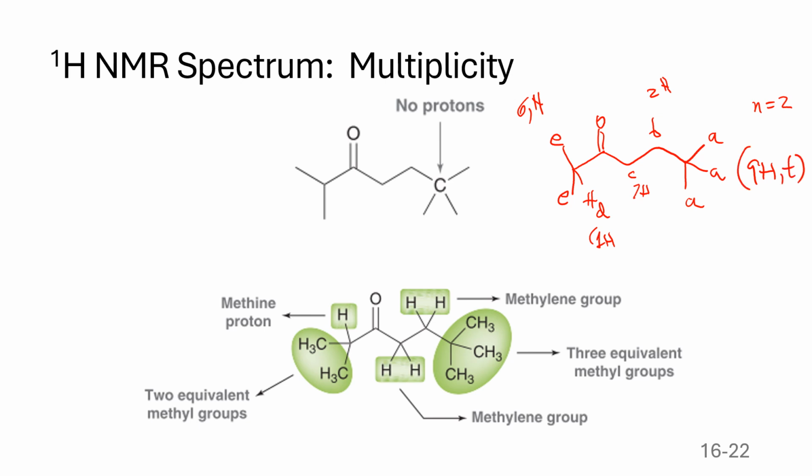Now, B is complex because, well, it doesn't have neighbors here, so it's not that bad. So it sees 2 neighbors, so it is a triplet as well. So 2 H's is a triplet. C also is a triplet. There are no H's here and only on that side, so it's another triplet, right? And then here, this proton type, this has 6 neighbors. In protons, the type E is 6, and it is a doublet.